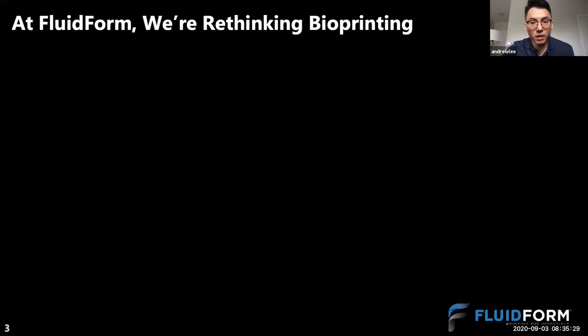As a company, a lot of our thoughts on bioprinting were developed at CMU, where we think this can be boiled down to two key problems that must be solved for us to progress. First, if you're working in the field of tissue engineering or regenerative medicine, a lot of you are probably working with a unique material that has certain desired properties for a certain function.